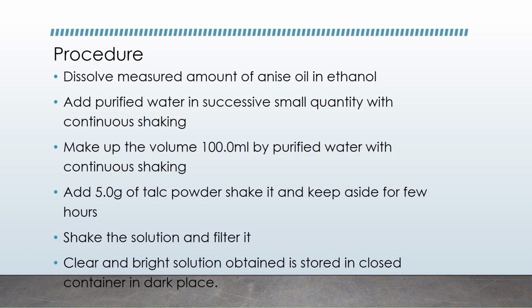And in our aromatic water or concentrated anise water, we are not preparing an emulsion. We don't want to see the oil separate and then the water separate. So we bring in talc to absorb the excess oil that didn't get dissolved in our ethanol concentration. So when it comes in to absorb the excess, we find that by the end of the day, after the few hours, our preparation will remain pure.